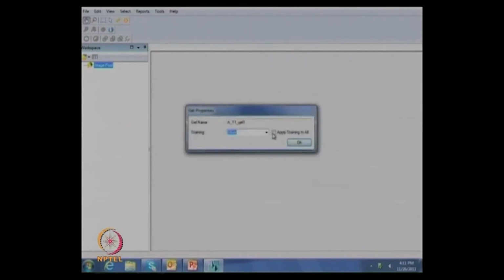So, you are processing 6 gels at a time. These are all the 6 gels. Basically, 2 sets with 3 replications for each gel actually. Right. That means one is control and another is the treated, in that way.